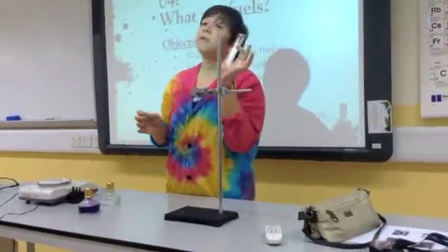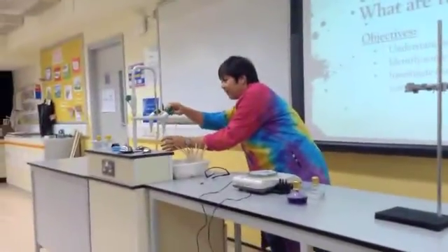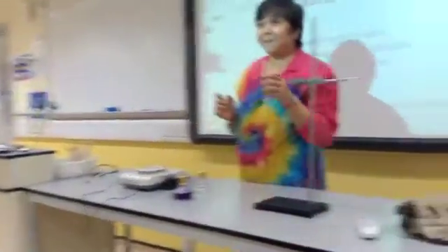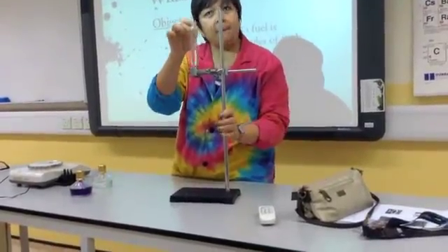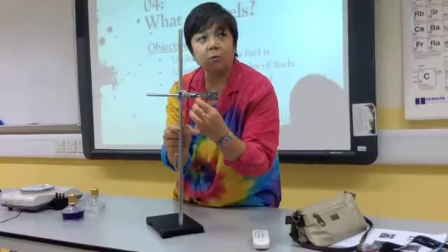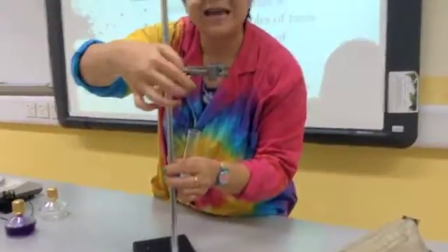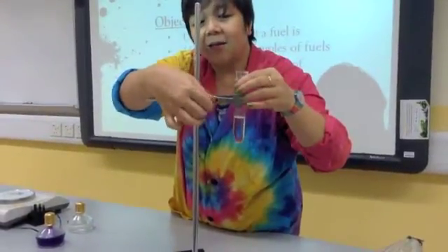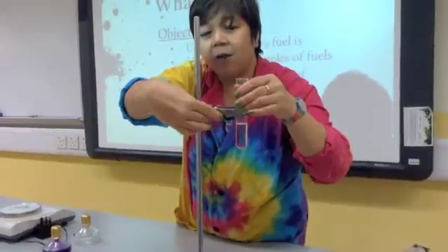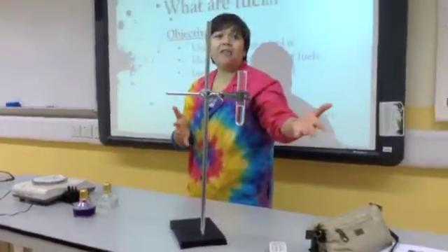You will be using a boiling tube with some water. I'm back with the water. Now, I can't insert this here so I have to open up the clamp. There's a special screw over here, and you have to loosen it so I can insert the boiling tube. I can let go and it stays — magic!